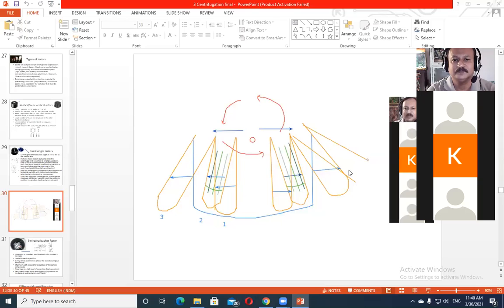Sir, I said 45-degree inclination. Okay, 45. That is why I tried to draw this particular tube at approximately 45 degrees. Is there any other answer for that? Anybody else? Clear separation. Instead of 45 degrees, if I take 55 degrees, then what would happen? Is 45 not better? Sir, maybe there will be chances that the liquid sample will be more spread on one wall or something like that. So what happens? Is it a problem?